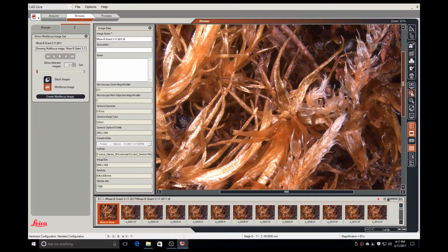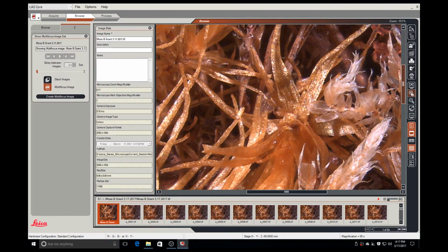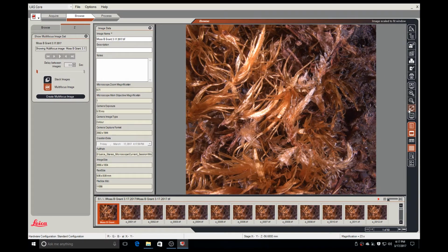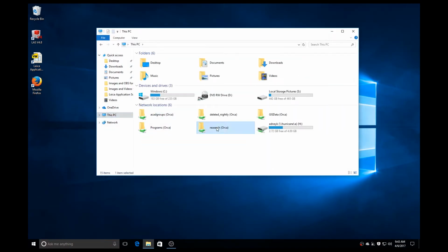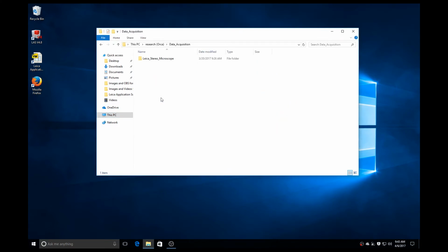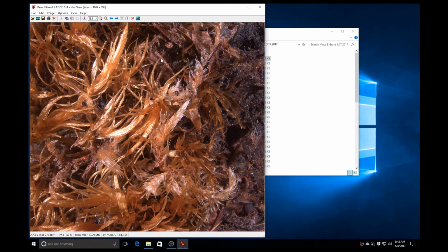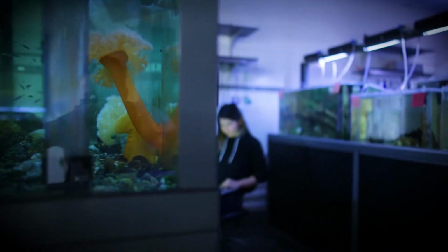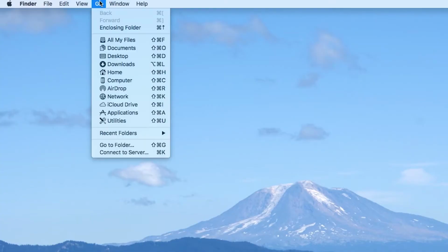Once all of the images have been taken, the software will process them into a completed image montage and save them to the current session. Once you have an image that you are happy with, make sure you save it. Images are saved to the current session folder of the local drive while you are logged in, and then to the recent sessions folder on the local drive and on the instrument folder on Orca. You can access the Orca folder from anywhere on campus.